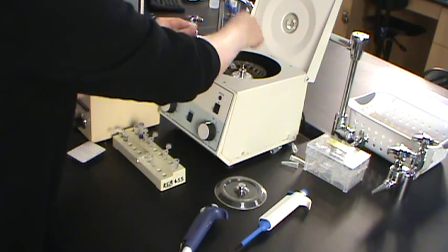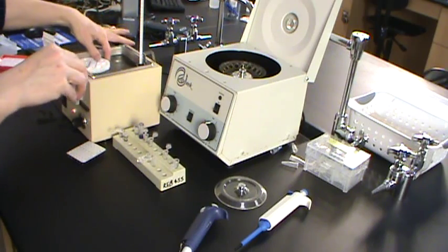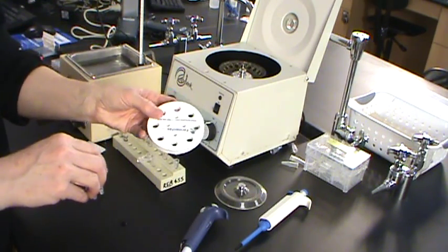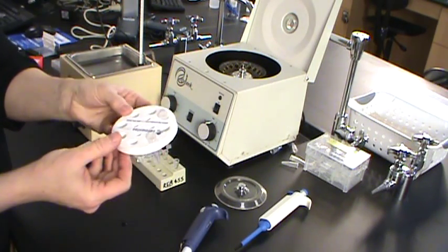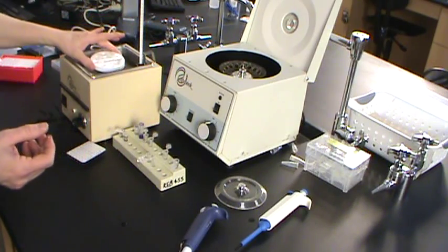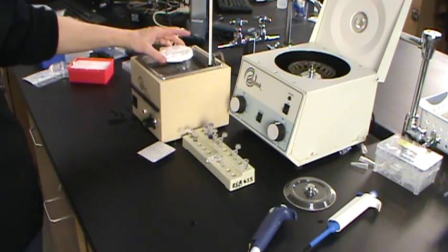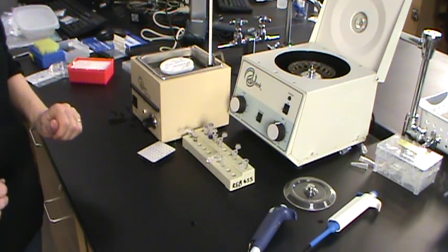Our incubations are going to be done in a water bath that's kept at 37 degrees. And what we'll have are these floating devices that you can put your tubes in, and then just float that in the water bath and leave it for the period of time that is required.